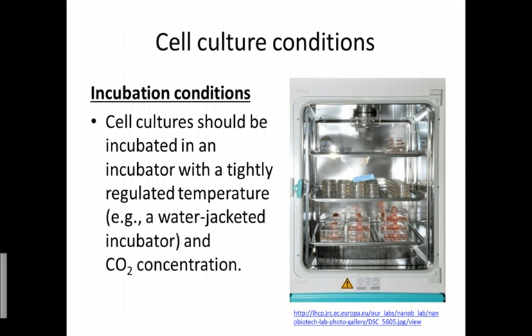So we will culture the cells in the CO2 incubator. This incubator is different from the ones that you use to culture bacteria. This is an incubator that is water jacketed, which means that they will have the water tray beneath here, which is filled with deionized water, and it is supplied with 5% CO2.